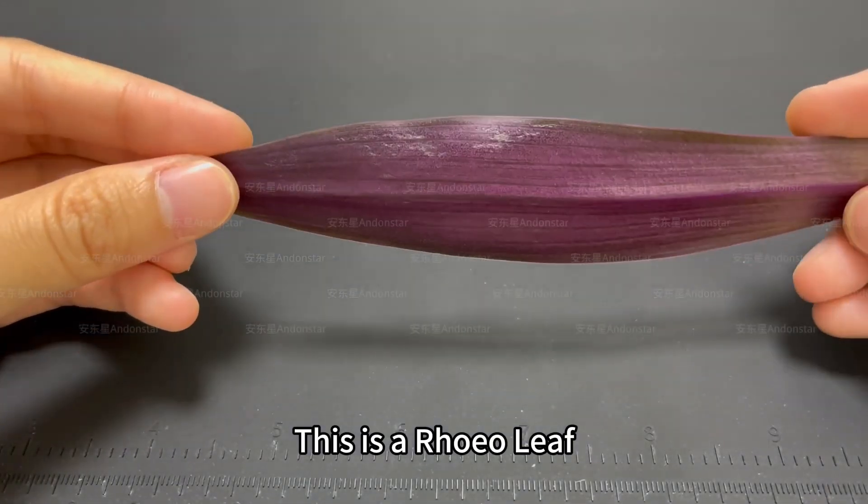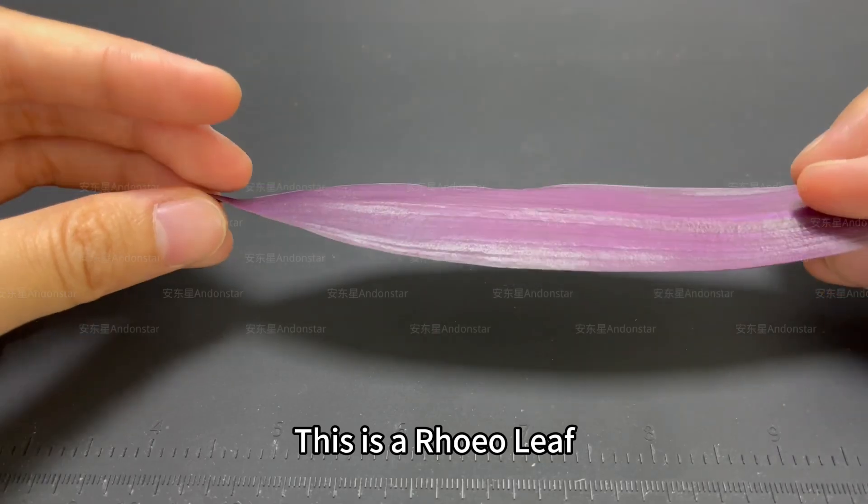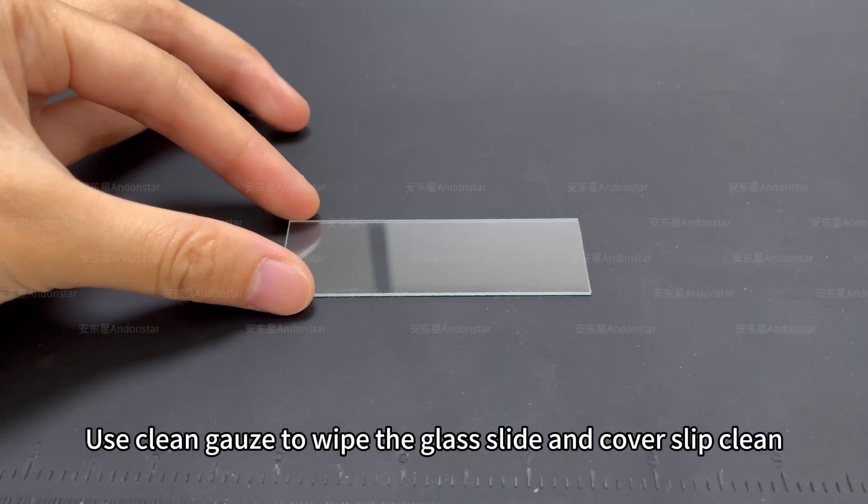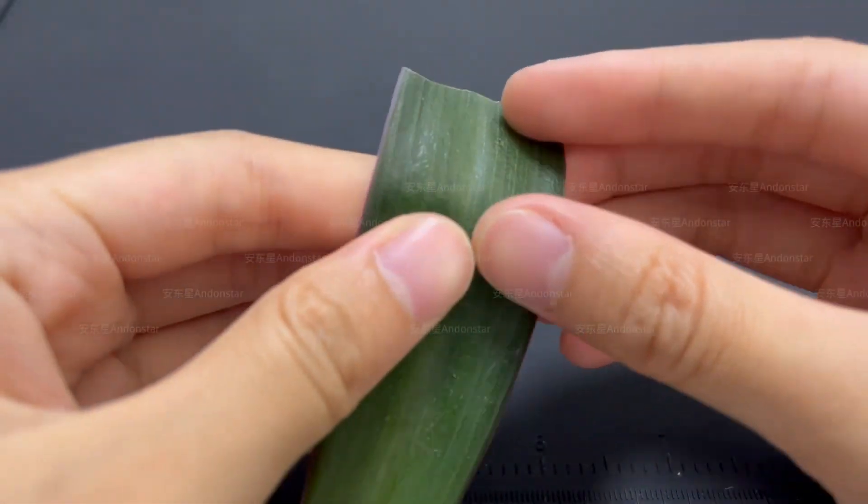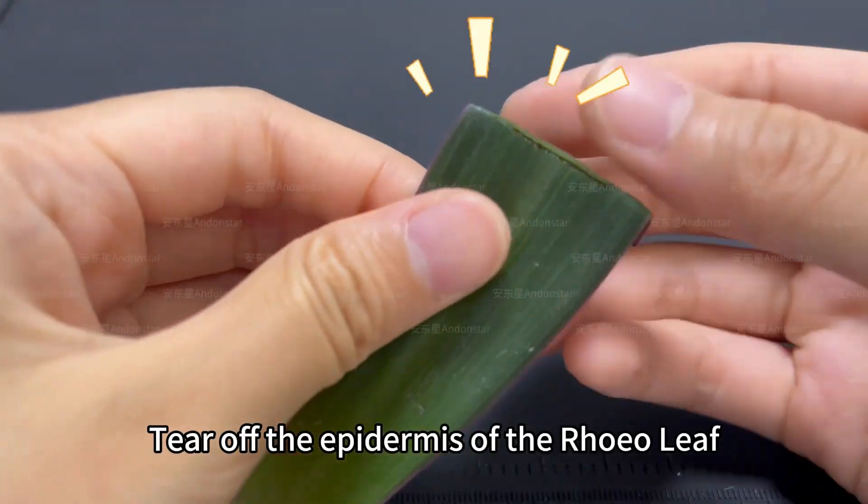This is a Rhoeo leaf. Use clean gauze to wipe the glass slide and cover slip clean. Tear off the epidermis of the Rhoeo leaf.